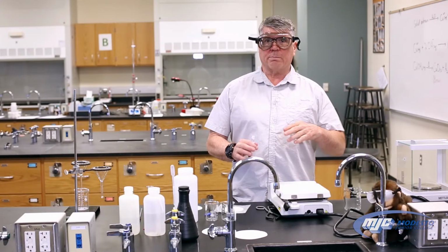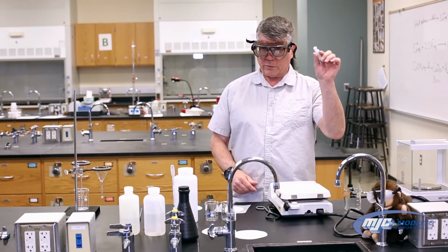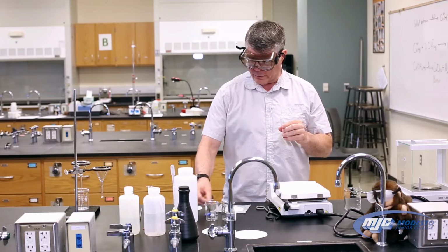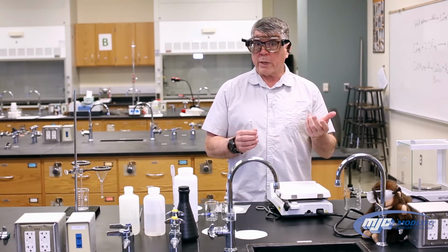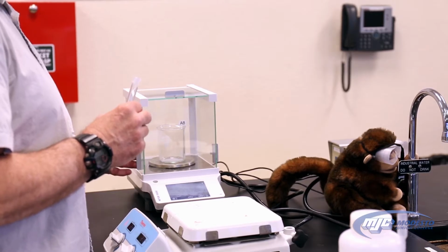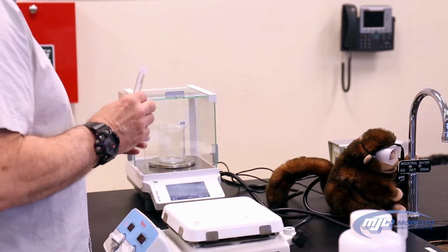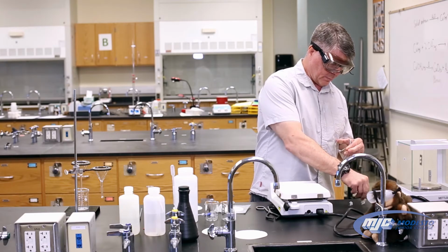All right, guys, so this is part A of the gravimetric analysis experiment. What we're going to do is take our solid unknown, which looks like this. And as always, we have an unknown number, so we take that off and tape that in our data table. We want to weigh out somewhere between 1.8 and 2 grams of this. So we take our 250 milliliter beaker and place it on the balance. Because we don't care how much that beaker weighs by itself, we tare the balance. And because we never add anything directly on the balance, we take the beaker out, put some in, and go back and forth till we get somewhere between 1.8 and 2 grams.